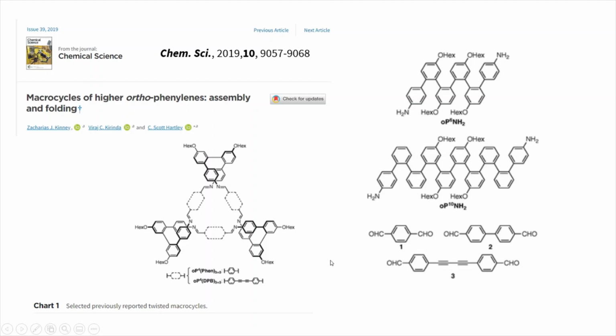So let's see how to set up these kinds of reactions to make the Schiff base, and what precautions you have to take care of. I'm now showing the video of how I set up this kind of reaction.